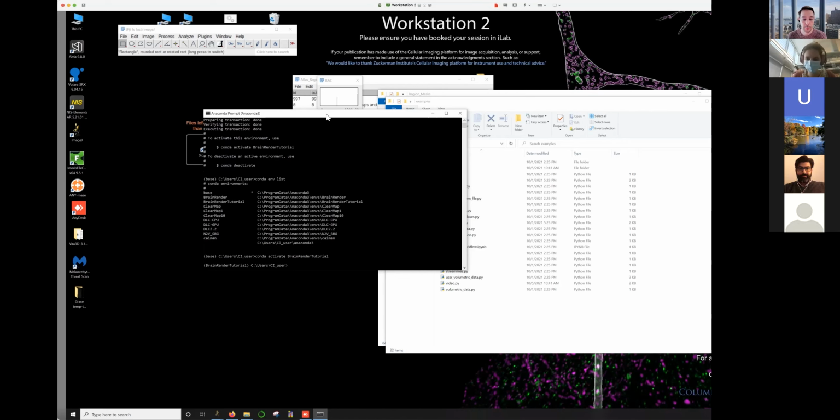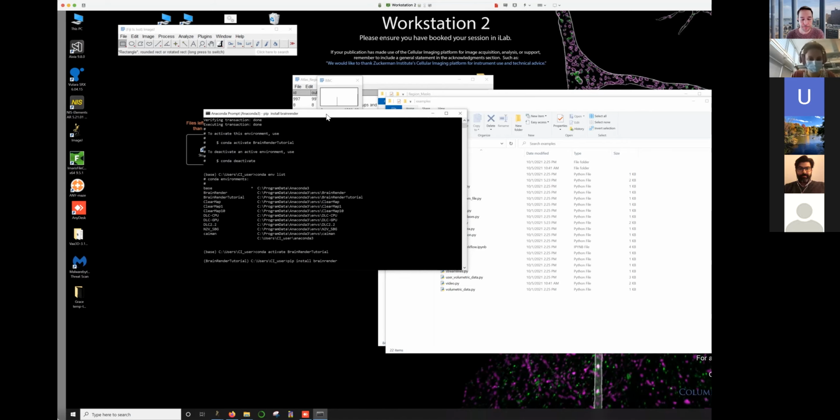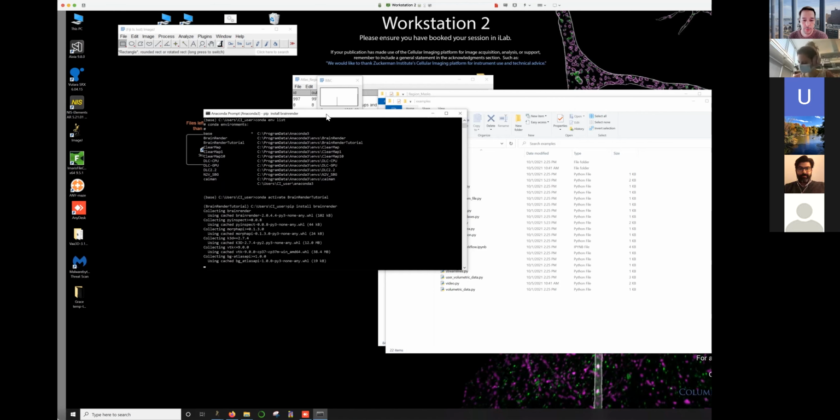And then to get BrainRender installed, we just type in pip install BrainRender. This will install BrainRender and all the dependencies, and this shouldn't take too long either.